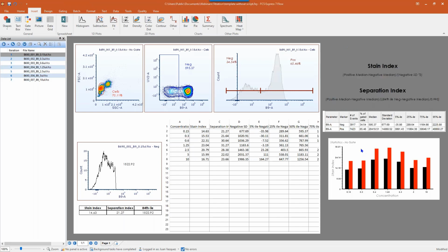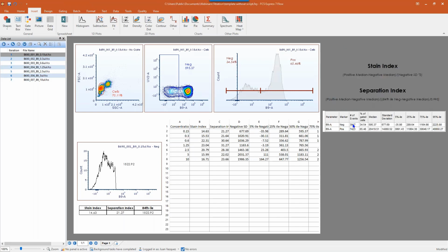Okay, so how did we get here, first of all? Well, what I'm going to do is open up a brand new layout.